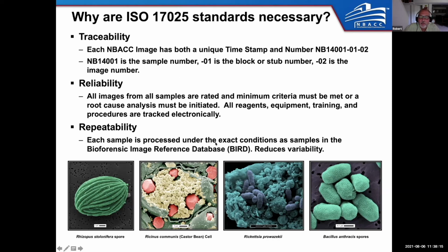And we process each sample under the exact same conditions because we have the database that we've developed called the Bioforensic Image Reference Database of all these hazardous organisms. And if we need to compare anything new to it, we have to process it the exact same way so that the client can have confidence that the images we produce now are the exact same as the images in the database, okay?